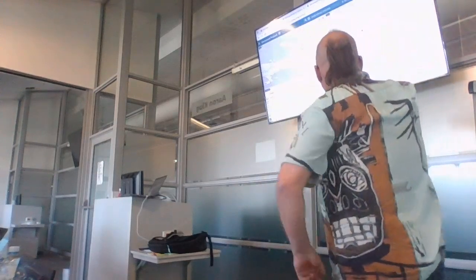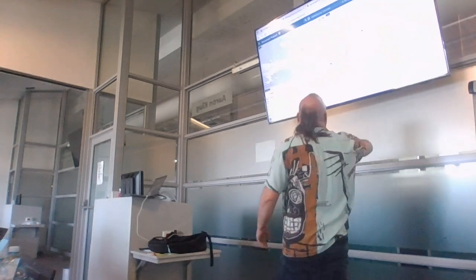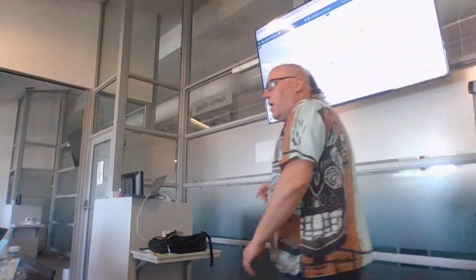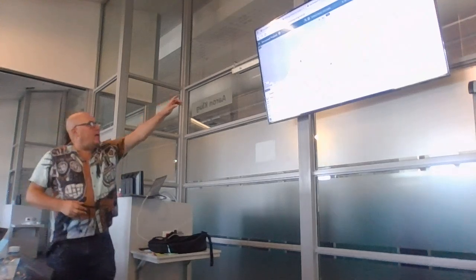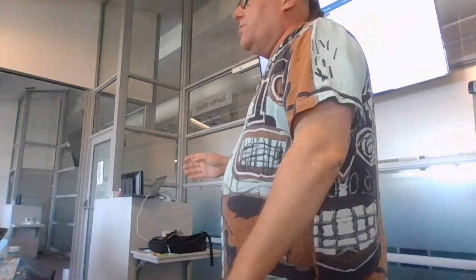Then 370 is collected in 2014. So somewhere in the middle time-wise. But 253 is collected from the environment. Okay, let's zoom in again on the map. You see the environmental collection is here along this river. Okay? And 373 and 370 are collected from clinical samples.